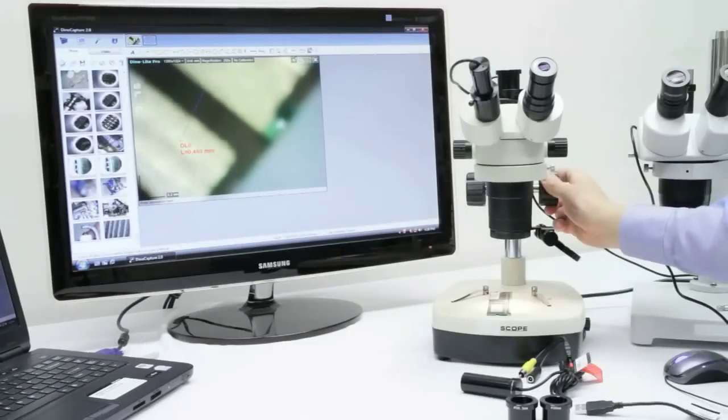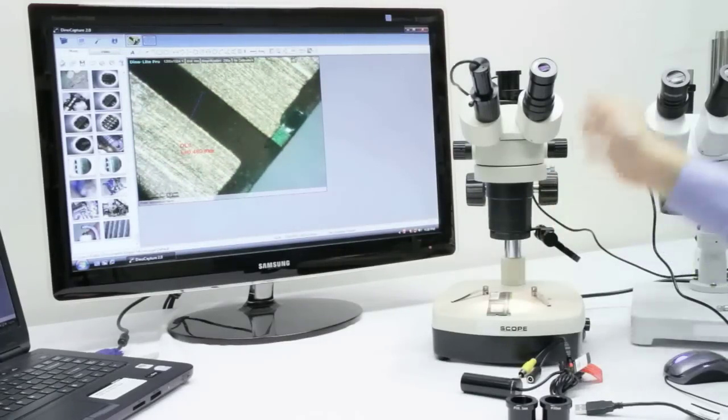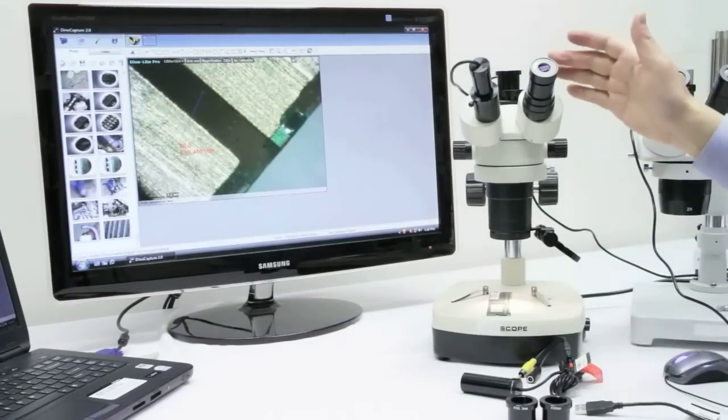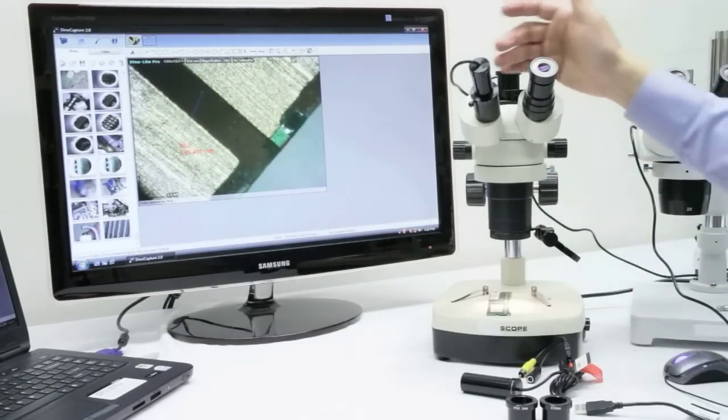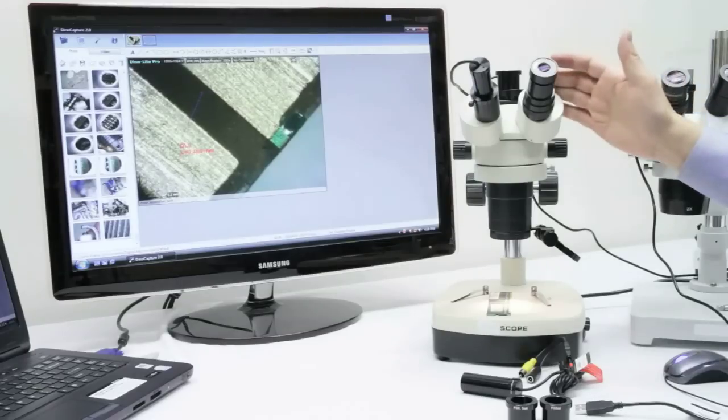The AM423X and AM423XC both come with the DinoCapture 2.0 software that includes measurement and calibration.